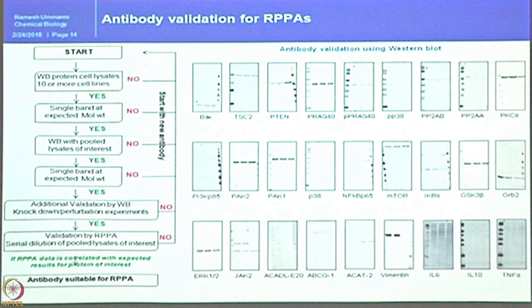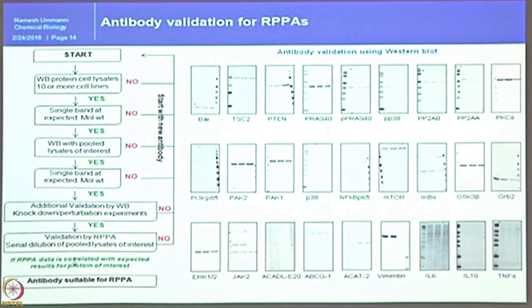Antibody validation is laborious — we used to run hundreds to thousands of western blots for this purpose. Some antibodies give nicely clean single bands, while others show non-specific bands, and some are completely unusable. From personal experience, good results came from Cell Signaling antibodies, whereas Santa Cruz antibodies were less reliable. If an antibody gives a single band, it proceeds through the validation pipeline. Those with multiple bands are dropped immediately, and another antibody is purchased instead.